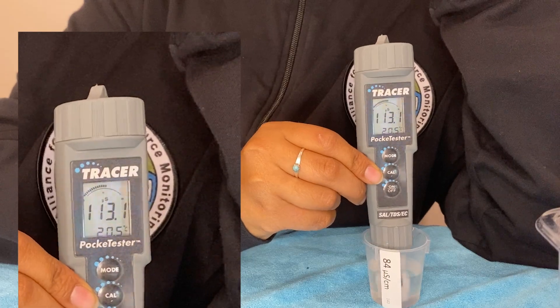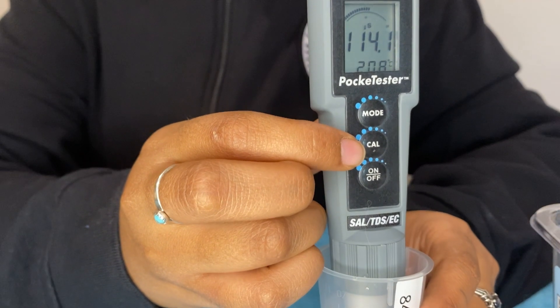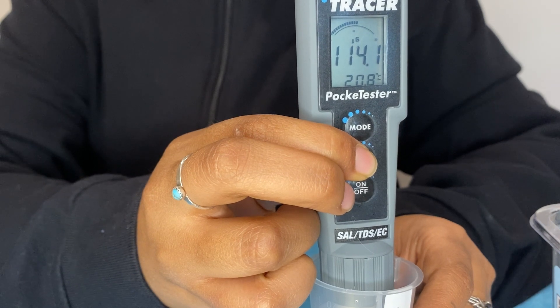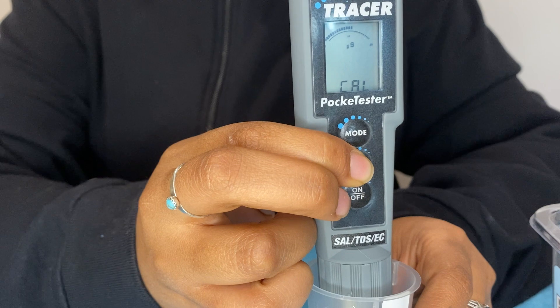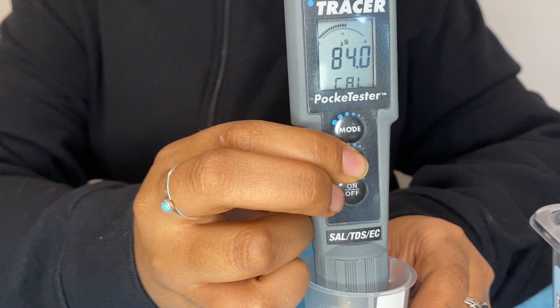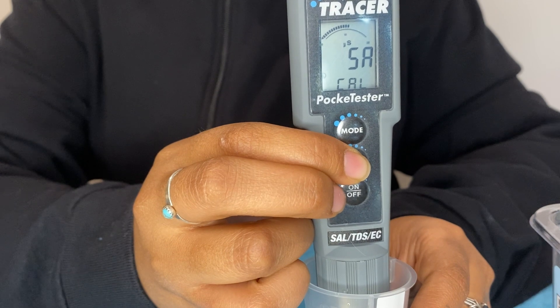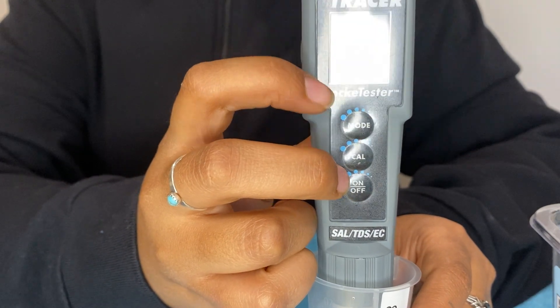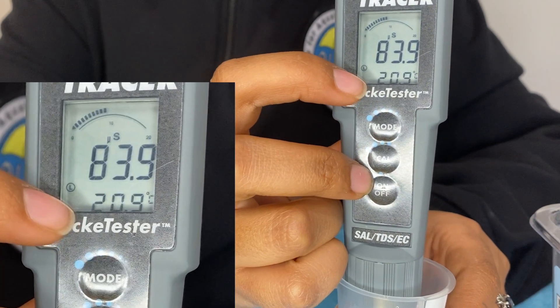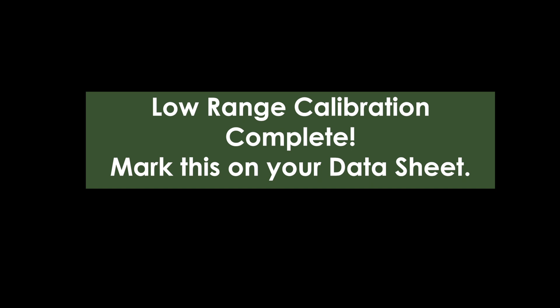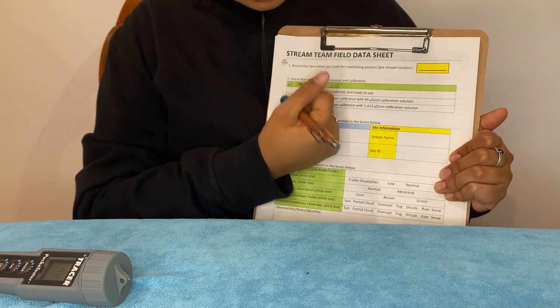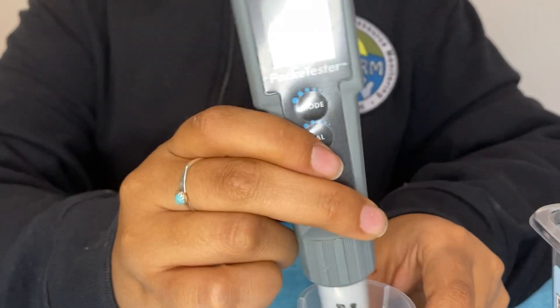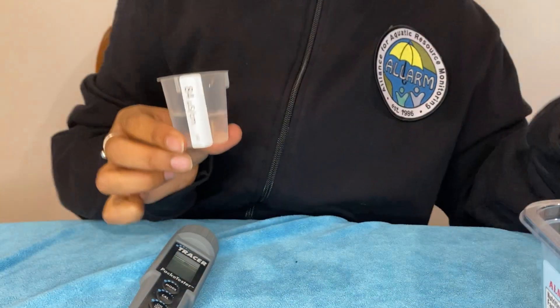Once the reading is stable, press and hold the CAL button for approximately two seconds until CAL appears on the bottom of the screen and 84 flashes. When the meter is finished calibrating, SA and END will briefly flash and return to the meter's home screen. If SA and END do not appear, your meter did not successfully calibrate and you'll have to start from the beginning. Once your meter is calibrated, you will notice a small L in a circle at the bottom of your screen, meaning your meter was successfully calibrated for the low range or 84 microsiemens per centimeter standard solution.